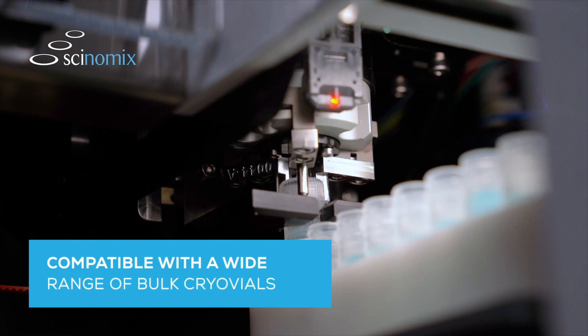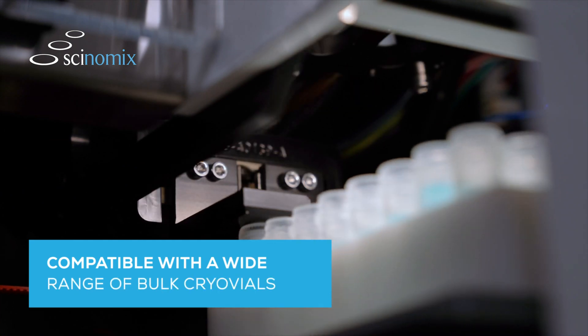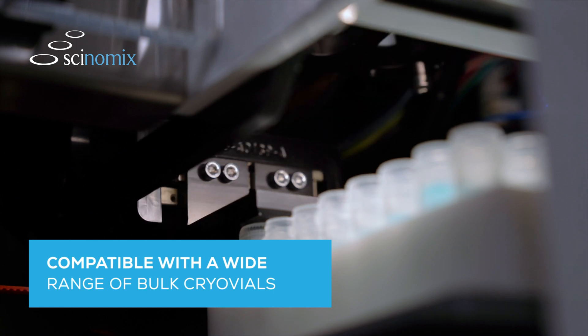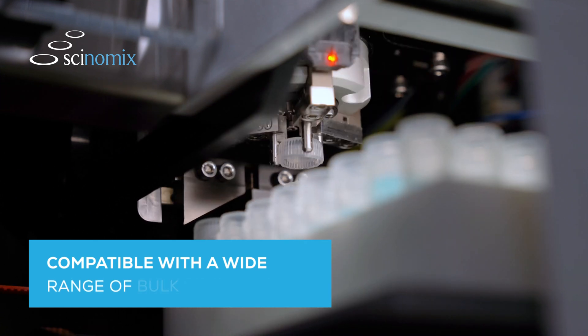Compatible with a wide range of inexpensive bulk cryovials, RapidCap2 provides significant savings over premium price tubes designed specifically for automation equipment.